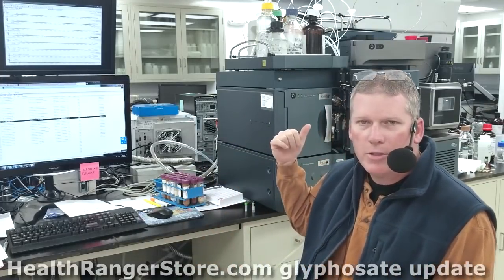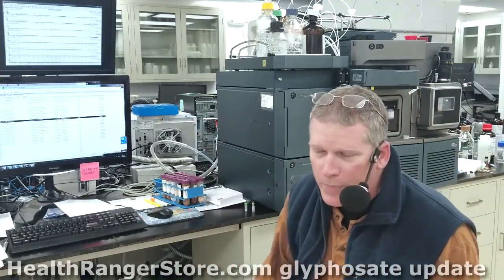We tried this with different instruments. We have multiple mass spec instruments in this laboratory. We have, for example, a mass spec time of flight instrument. We have a single quad mass spec. We have an inductively coupled plasma mass spec for inorganic heavy metals analysis. Ultimately, we decided that we needed to spend another $500,000, which is what this costs. This is $500,000 sitting here, to buy a triple quad.